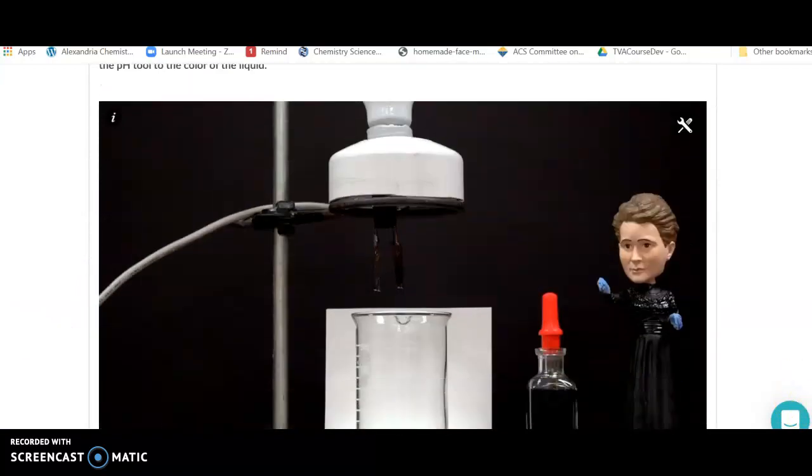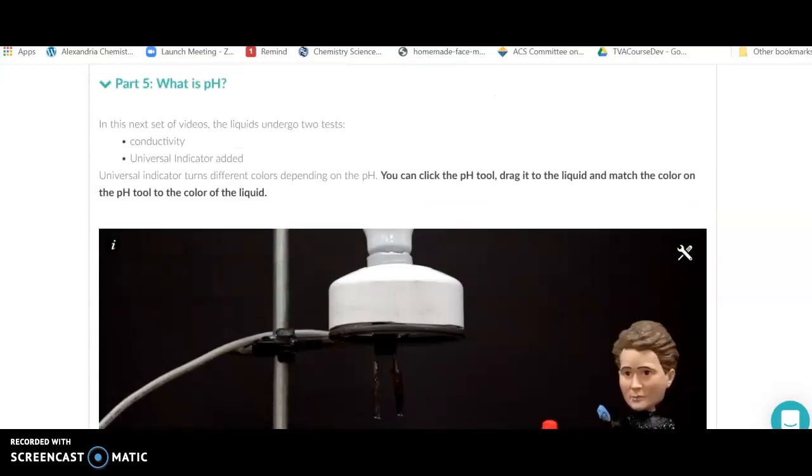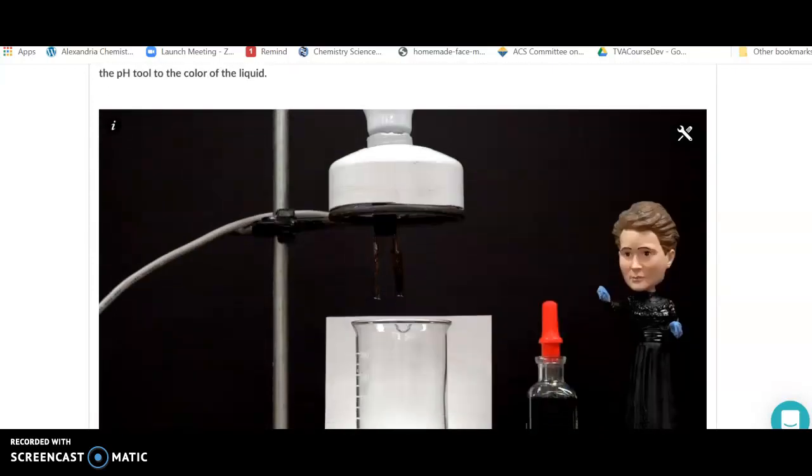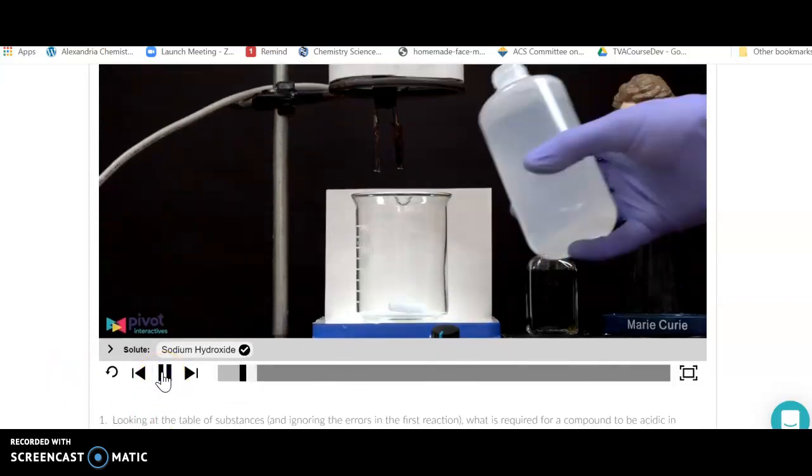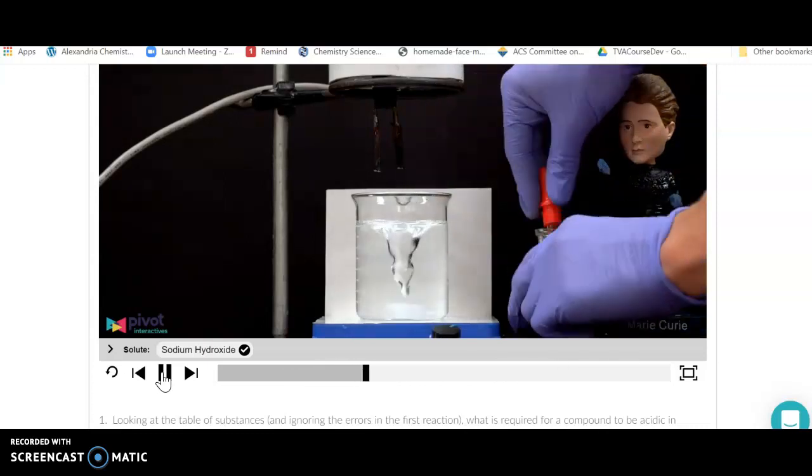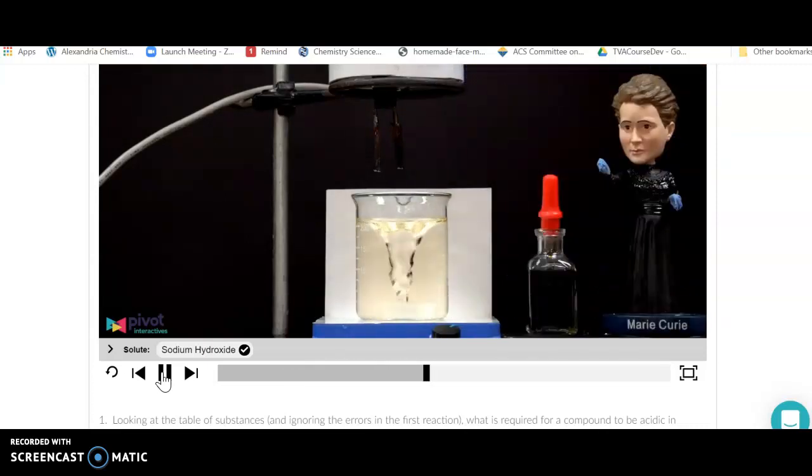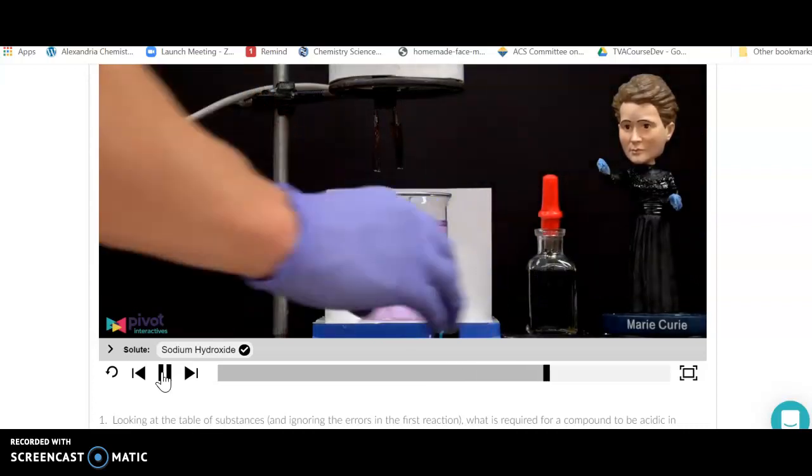The last thing you're going to do on this one is you're going to take your solutions and use the universal indicator as well as the conductivity test to see what kind of solutions you have. Now the universal indicator changes color as a function of solution. So let's say I want to do the first one, which is sodium hydroxide. They're going to put some of the solution in, give it a nice stir, add some universal indicator. Here, that was just water. Now we're adding the sodium hydroxide.